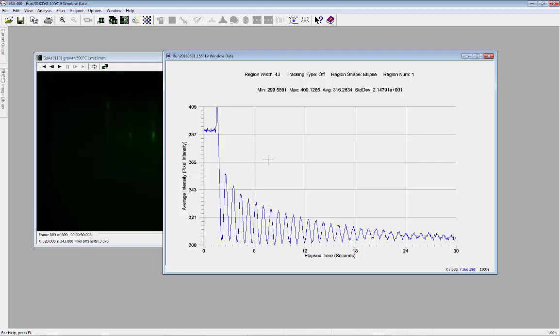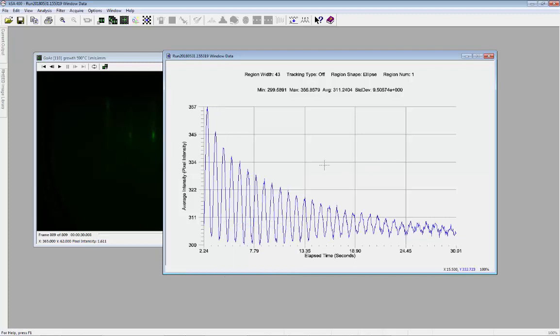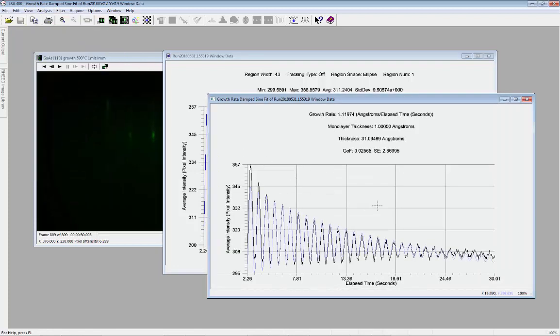I can specify the extents of the data to be fitted. In this case, I will select Set X Min to exclude the data at the start. From the Analysis menu, select Growth Rate Damped Sine Fit. This uses a least squares method to find the best fit to the displayed data. The graph shows the original data in black and the fit in blue.